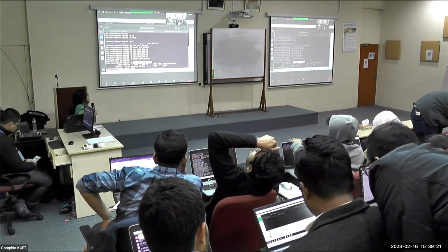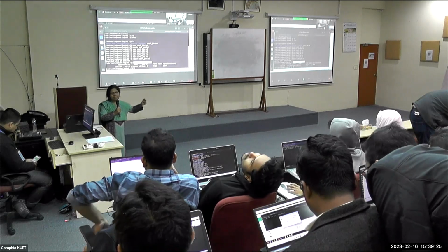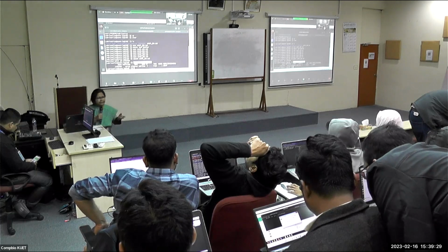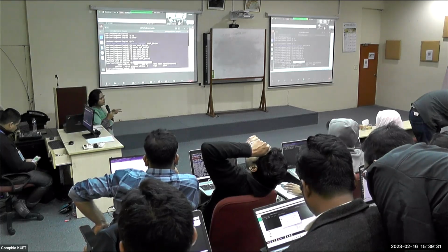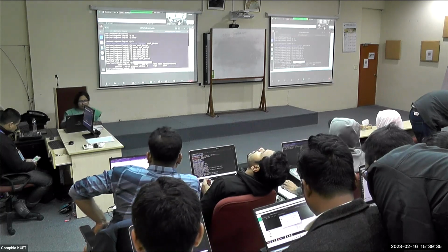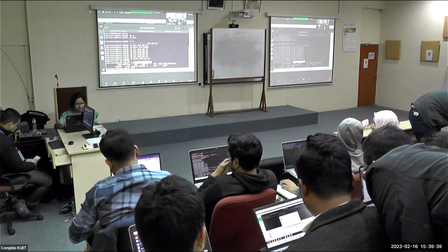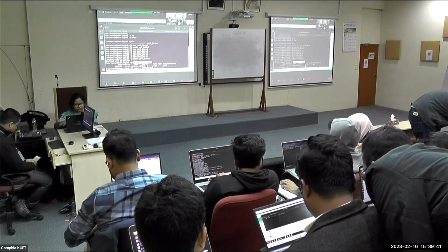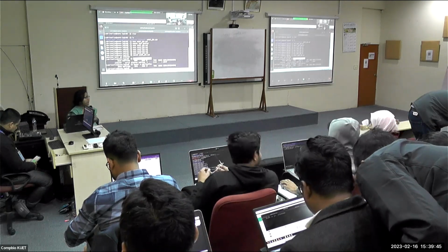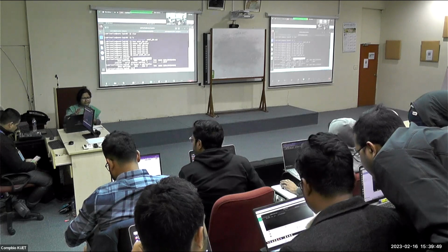Since we gave it two jobs, the first one is indexing, the second one is building the alignment. So it will take a little time because it's performing two jobs. And if I want to see whether it is still running, I will just repeat the command again. And now it is not showing anything. So I think it is already done on my side.